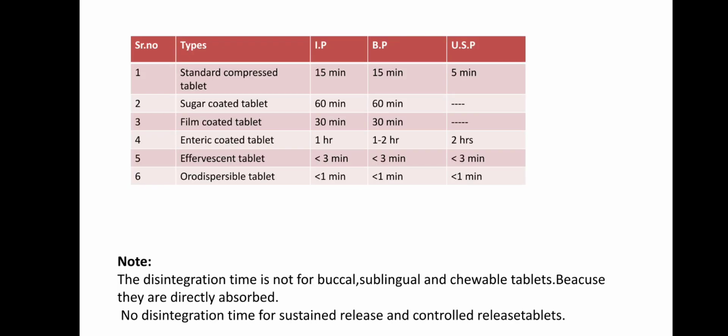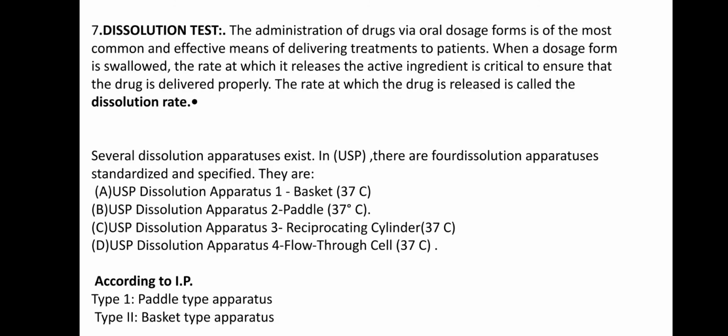Note: the disintegration test is not for buccal, sublingual, and chewable tablets because they are directly absorbed. There is no disintegration time for sustained release and controlled release tablets.